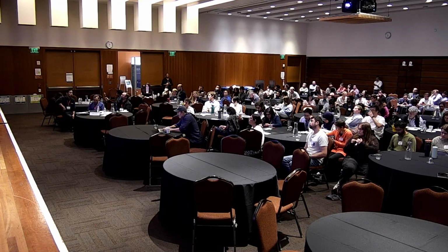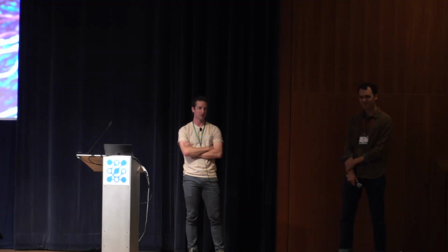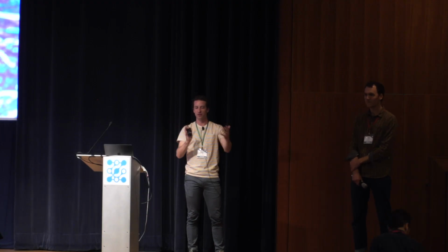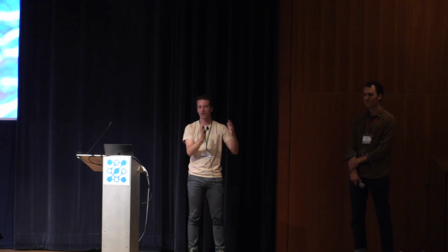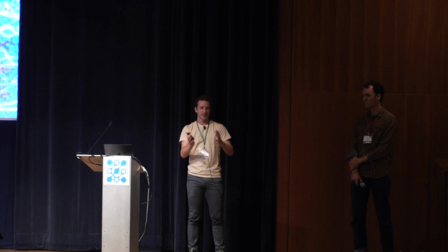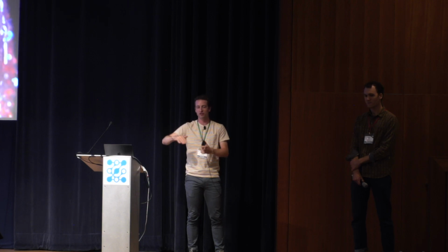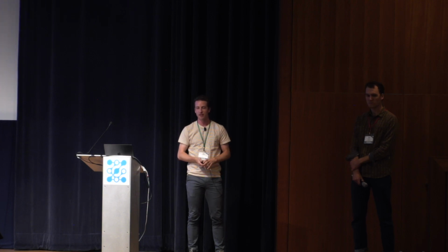Yeah, ideally yes. Currently there are of course still parameters involved. You start with a segmentation or a list of segmentations. There are still 3-4 parameters you need to tune to get it right for your data set. Ideally, this is for example fully deep learning free. You can use deep learning to do segmentation, but it's not necessary. It can be fully image processing.